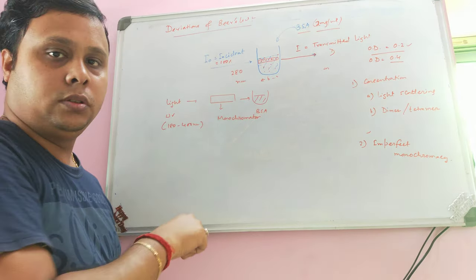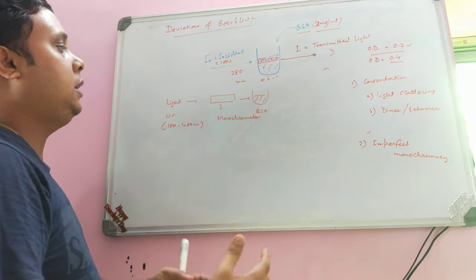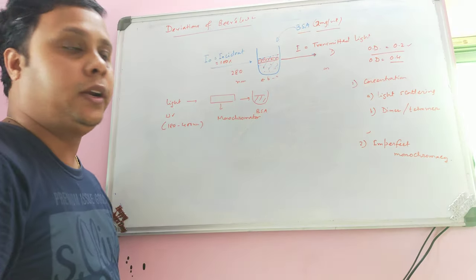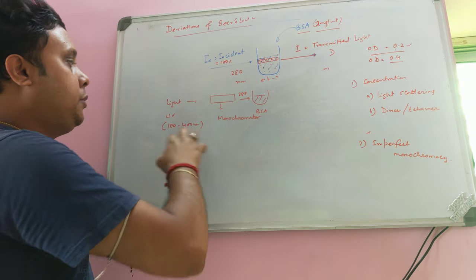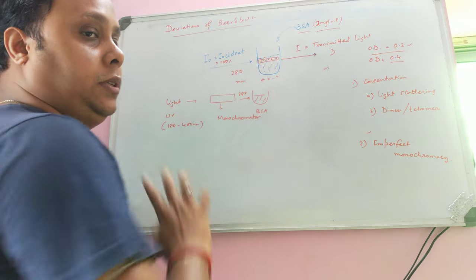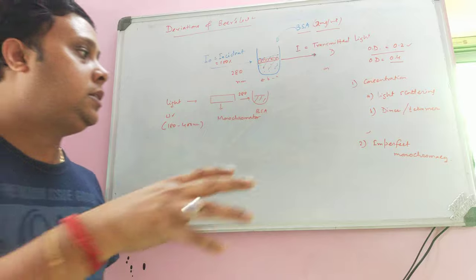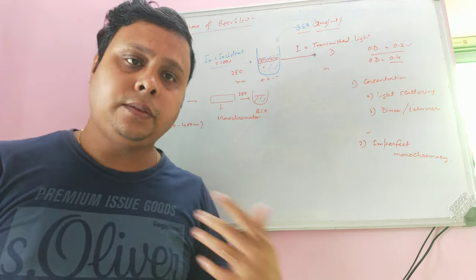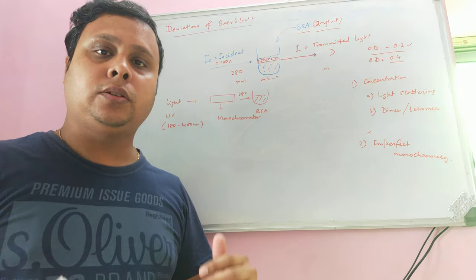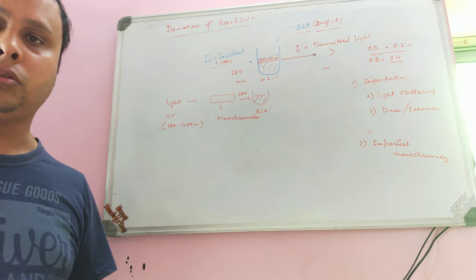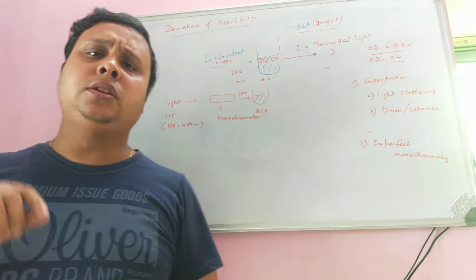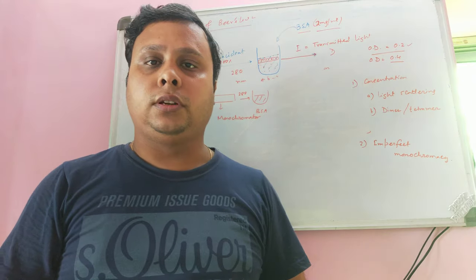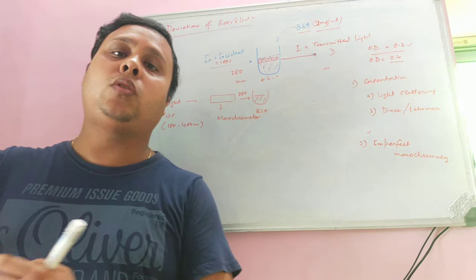In a spectrophotometer or colorimeter, we set the wavelength to 280 nm and the monochromator programs itself to transfer only 280 nm to the sample, absorbing all other wavelengths. However, with imperfect monochromacy, if the monochromator has an error, it may transfer not only 280 nm but also 270 nm, 290 nm, or 300 nm. You are entering 280 nm but the monochromator is actually passing polychromatic light — multiple wavelengths — to the sample.